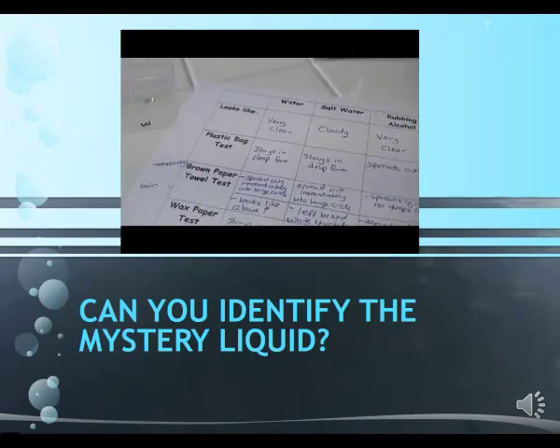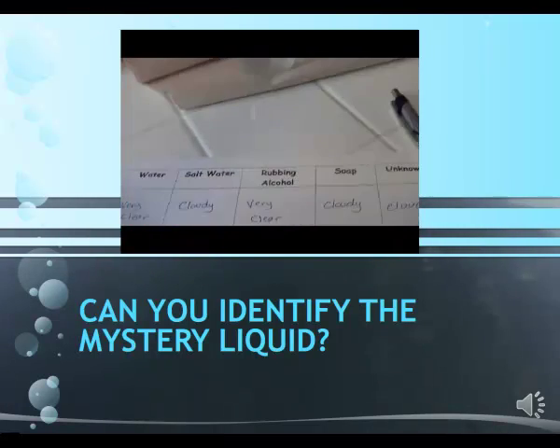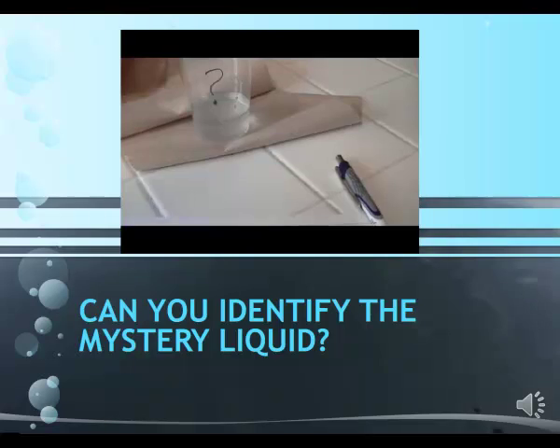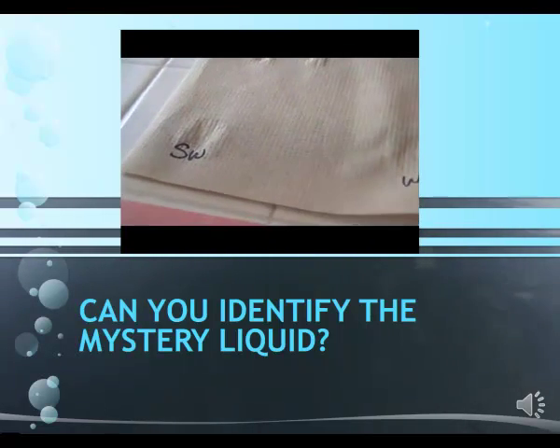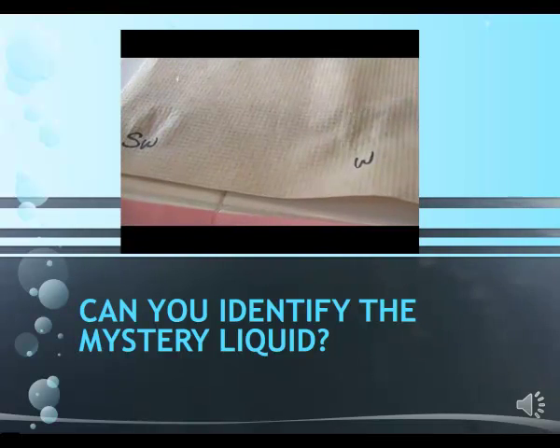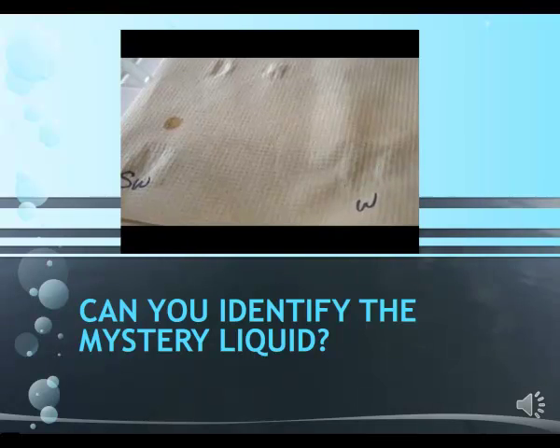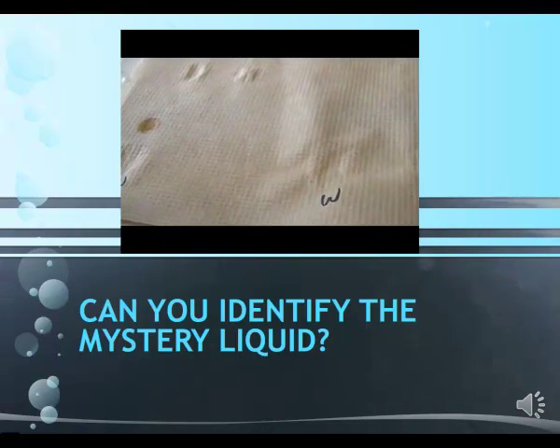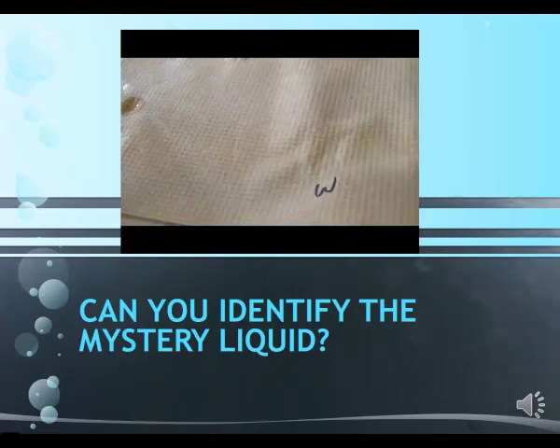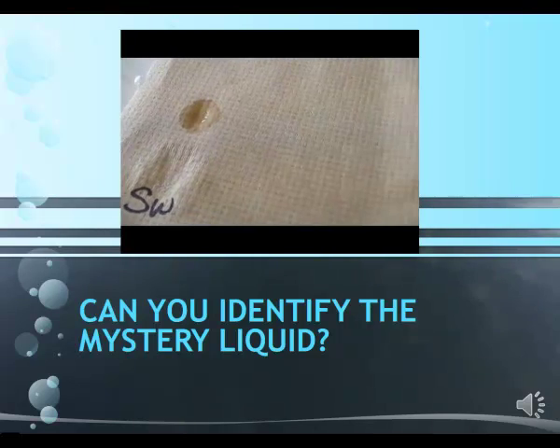But I'm going to go ahead and complete the rest of our tests. Fill up my eyedropper one more time. Salt water on the brown paper towel. Remember how it left some crystals behind? Okay, spreads out quickly, maybe a little bit of a drop form in there. But not exactly. That drop, it's gone. So it spreads out really quickly.